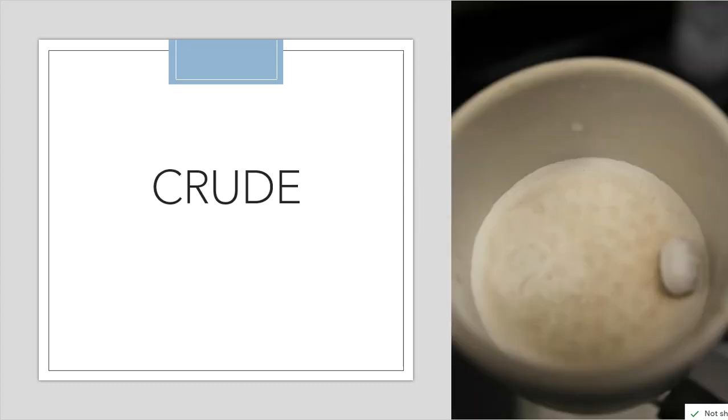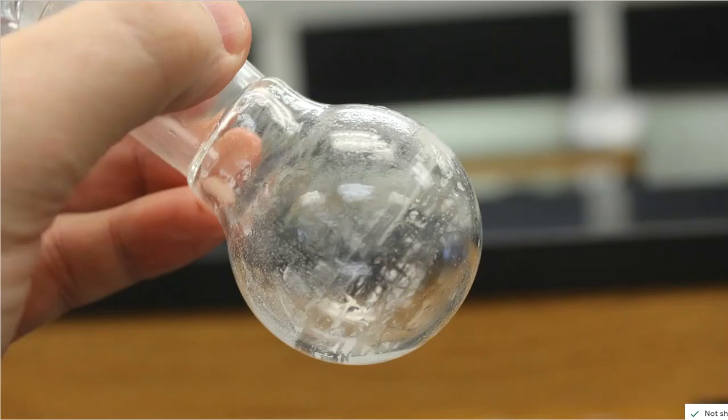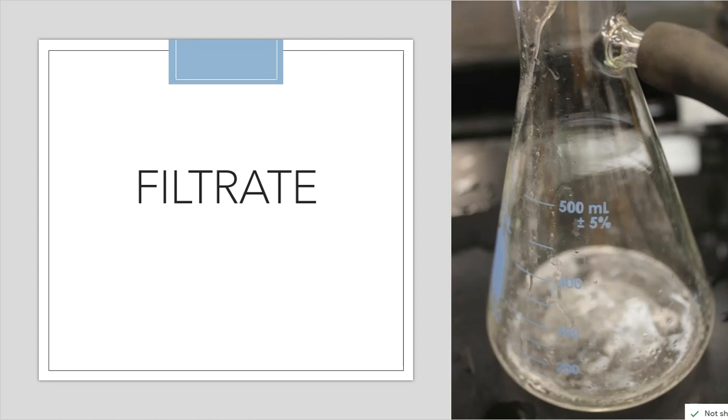So this is what the crude looks like on the filter paper. Notice, observation-wise, what it looks like. It looks a little dirty, doesn't it? It almost looks like it has some orangey brown that's left behind. And I'm still not quite done in my boiling flask yet. So that filter flask was a distraction for me. I still need to go in and add more solvent to that flask. And I did another 15 milliliters of ice-cold water, swirled, and poured it through.